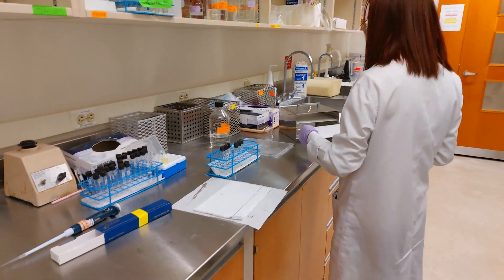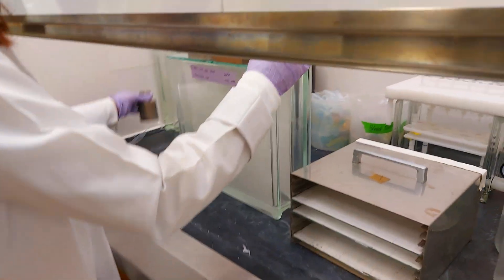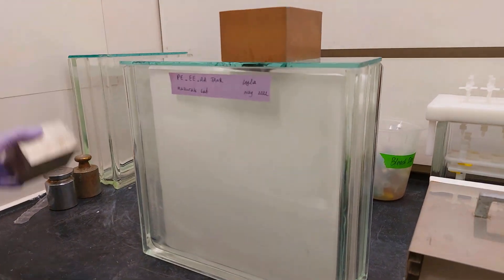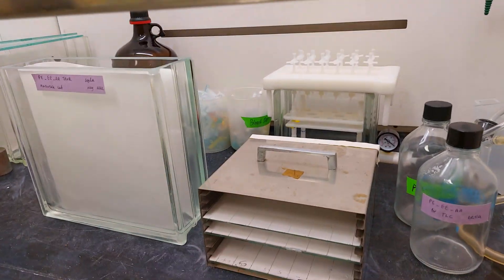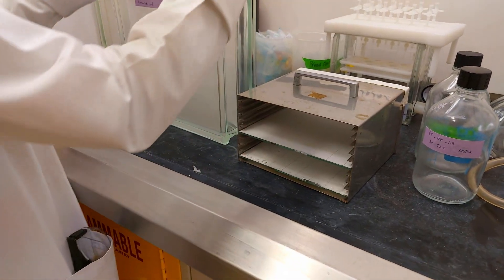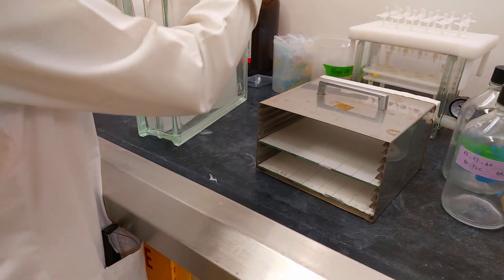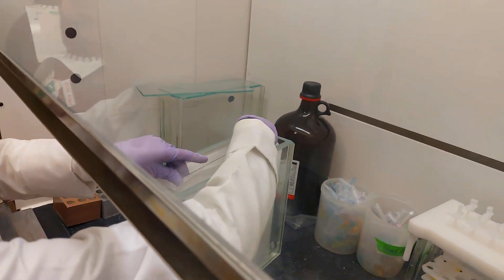Now we need to put the plates in the separation tank. This tank is what's going to separate all of the lipids. Normally the tank needs to be ready at least an hour before you start. The solvent system is petroleum ether, diethyl ether, and acetic acid — this combination is what separates the lipids. Gradually place the plates in there and then cover it.